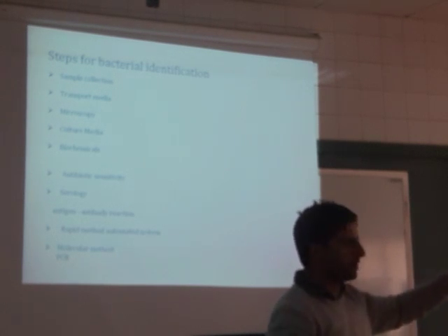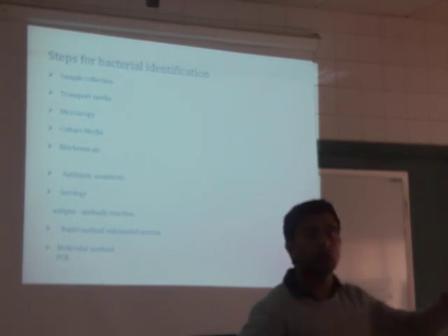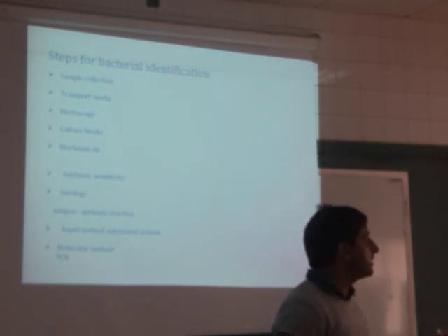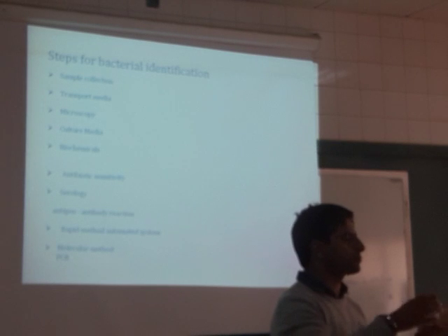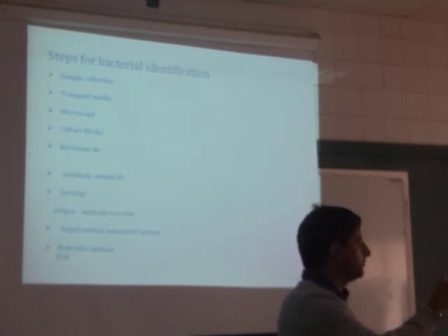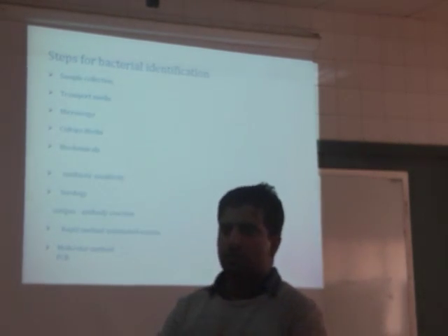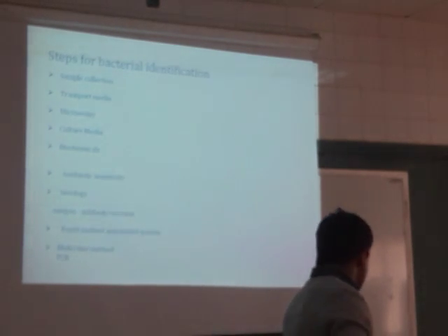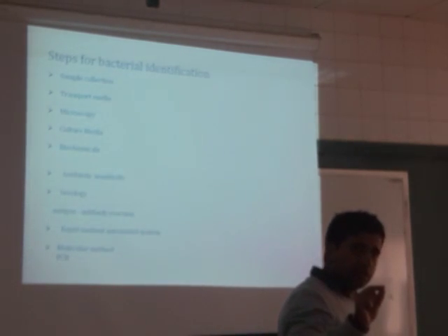It cannot stay, it will fall down. So agar is just simple. It solidifies the media. It holds the media. The actual media is present here. The media contains glucose, proteins, and necessary vitamins required for the microbe. Okay? So agar is a solidifying agent.